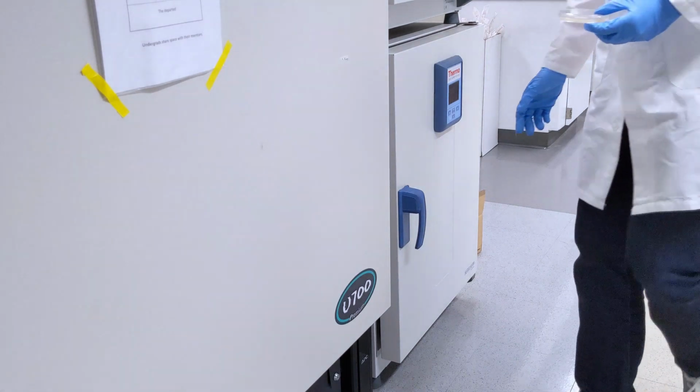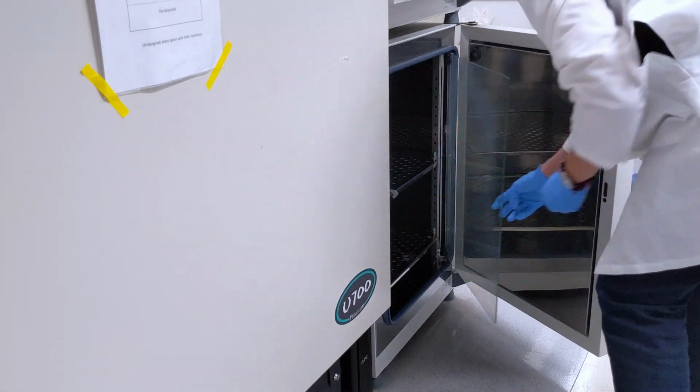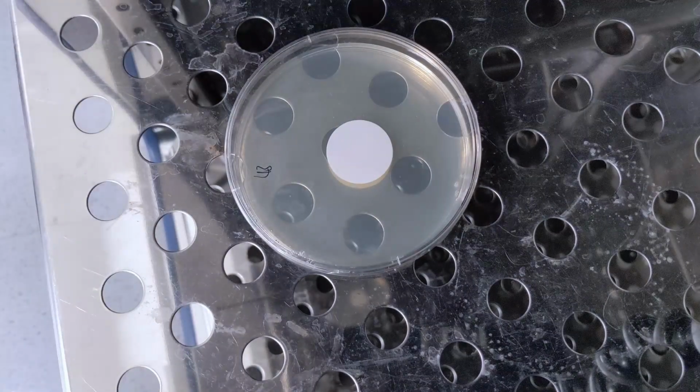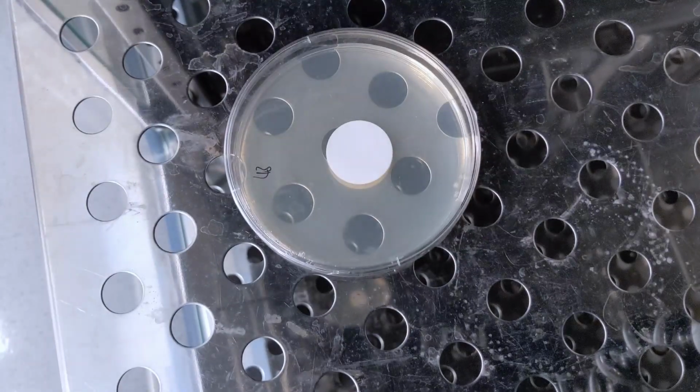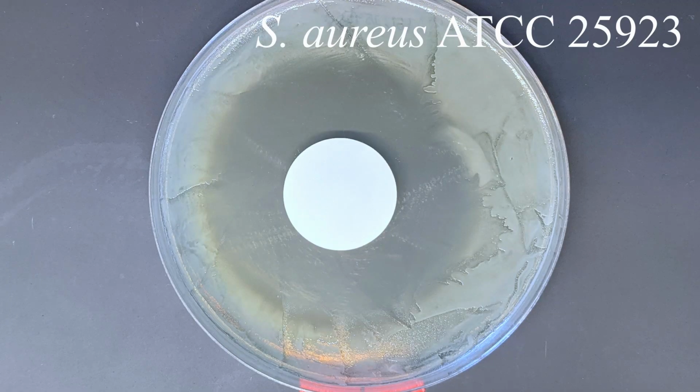Finally, we leave the plate in a 37 degrees Celsius incubator overnight, which is the optimal temperature for S. aureus. We prepared 4 plates. 1 placebo, using a filter with water instead of penicillin solution on the plate spread with S. aureus. And 3 plates with filters with penicillin solutions on the plates with 3 different S. aureus strains.